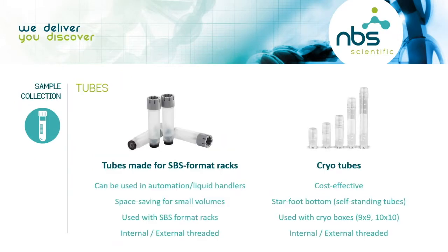So the tubes, we have some different tubes. For example, we have the SBS format rack tubes, and we have the cryo tubes. So these are some examples.